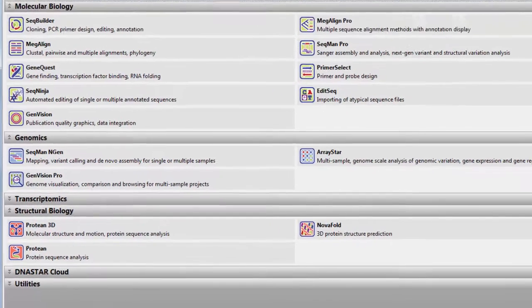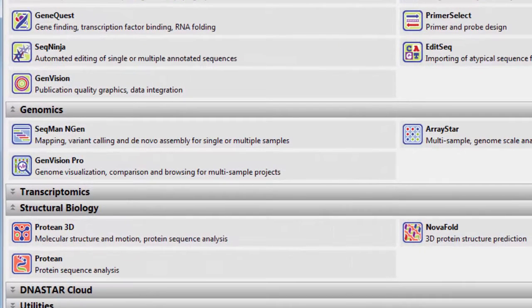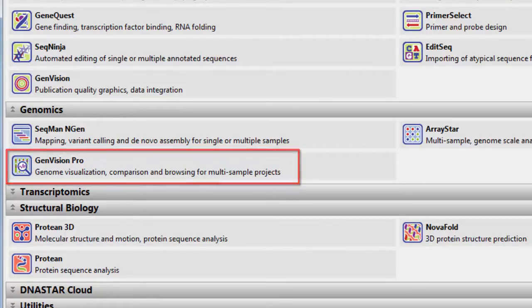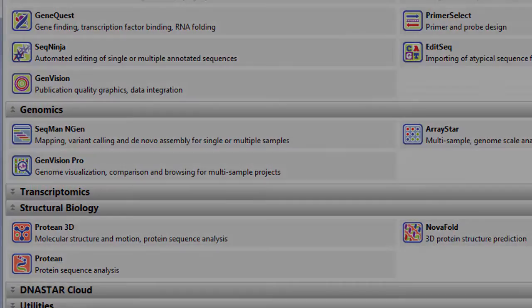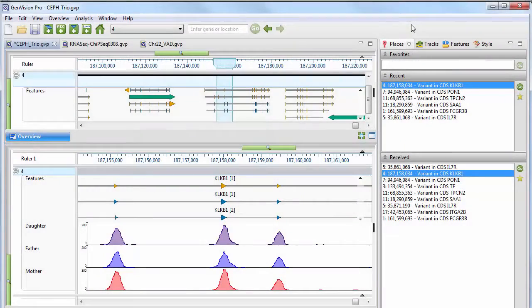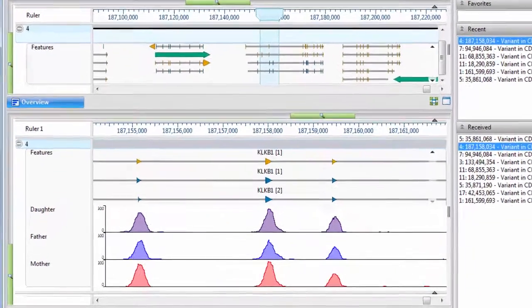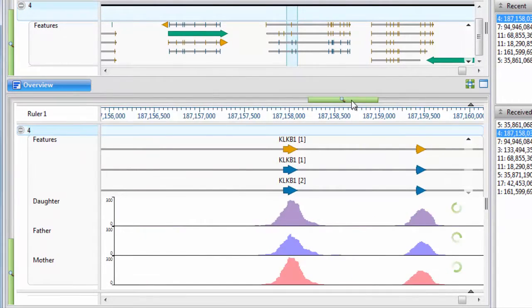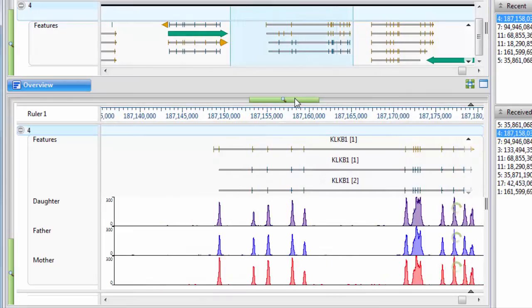GenVision Pro is DNA Star's application for genomic visualization and is a new addition to LaserGene Genomics Suite. With GenVision Pro, you can easily visualize, browse, and compare multiple genome-scale assemblies, including data combined from multiple project types.